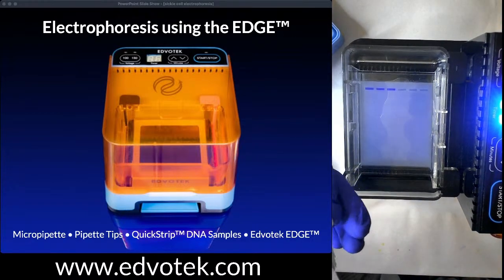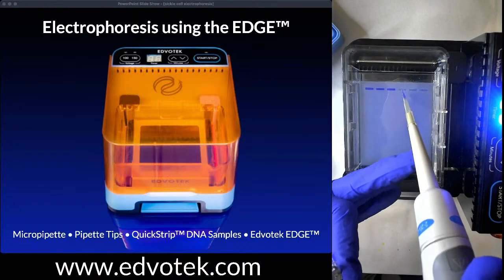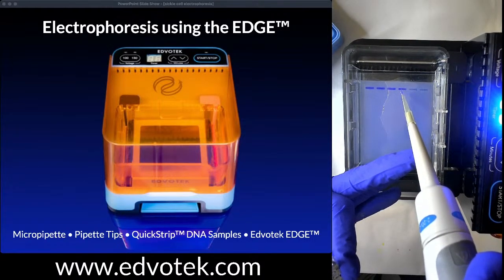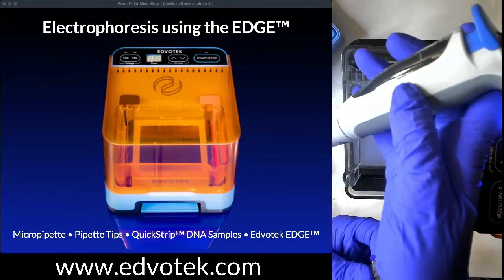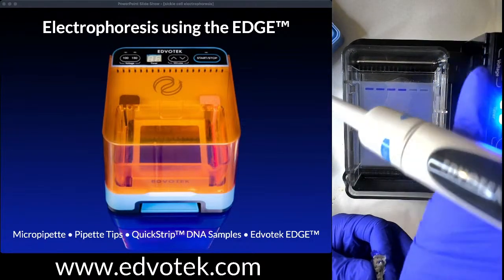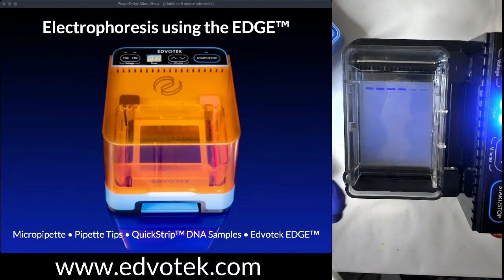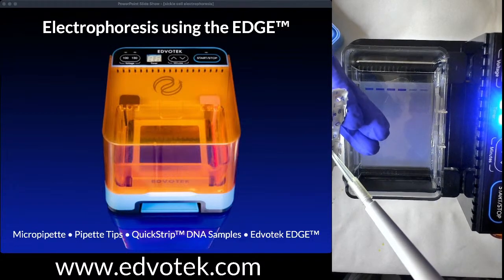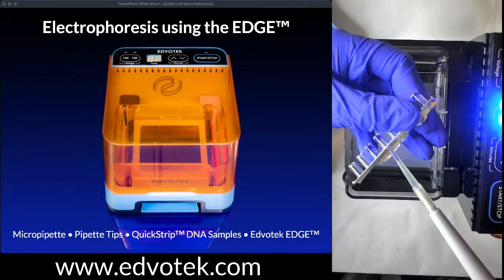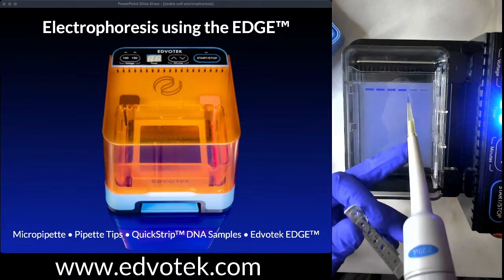And you can see, I have loaded many gels, both on YouTube and in person, but even under this most difficult of circumstances, it's pretty easy for me to get the samples in here. I'm loading our samples with an adjustable volume micropipette. This is a precision tool that's going to allow us to measure and move very small volumes of liquid. And you can see when I'm using the quick strip, I take my micropipette tip, I puncture the foil, and then I draw the sample up.